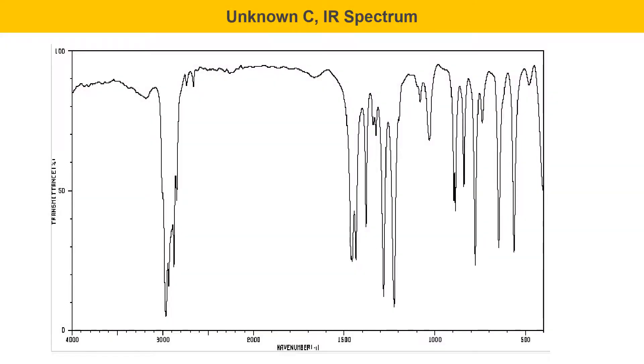Here's the IR spectrum for unknown C, and once again, I'll just remind you to ignore the fingerprint region. What's interesting about this spectrum is just how boring the functional group region is. There's very little going on, and that's an important feature that you need to make sense of.